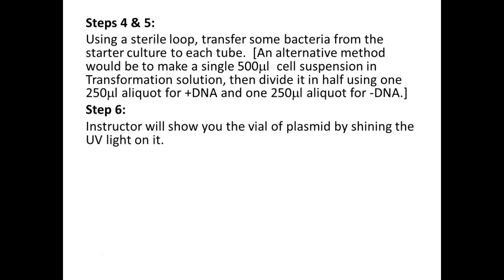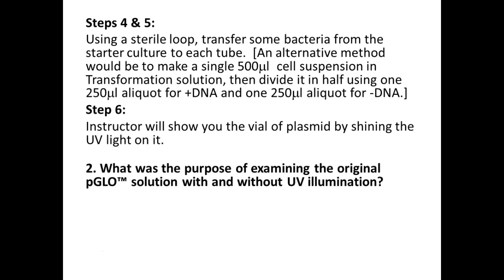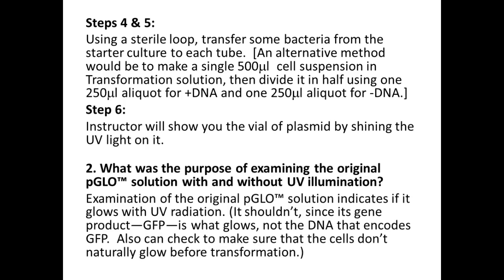Then I'm going to come around and I'm going to add the DNA to your plus DNA tube, so leave that one open in your racks. I'm also going to shine the UV light on the solution so you can see that it is just DNA. There's no protein in there, because if there was protein, it would glow, right? So this is to show you it's not a Chris Angel or David Copperfield magic trick. We're doing real science. Right? It is just DNA in that tube.